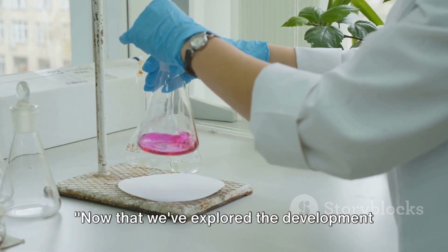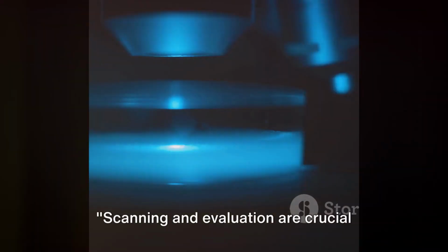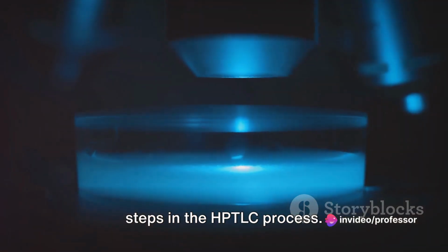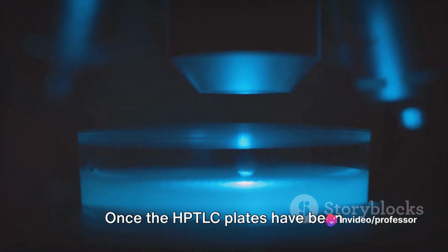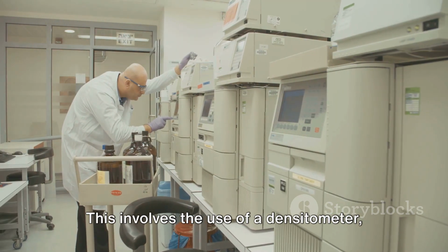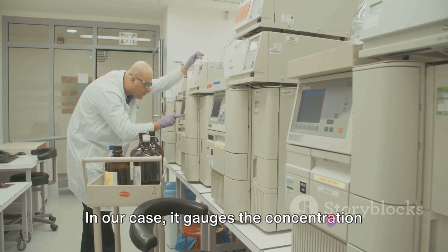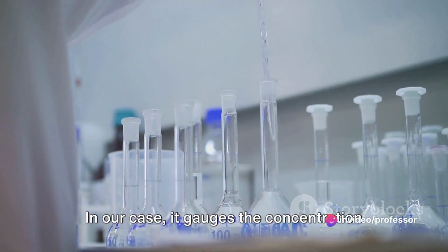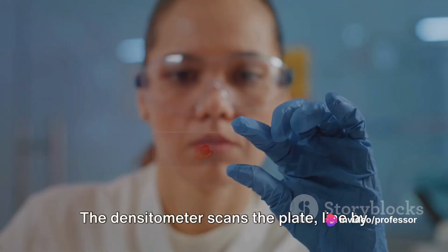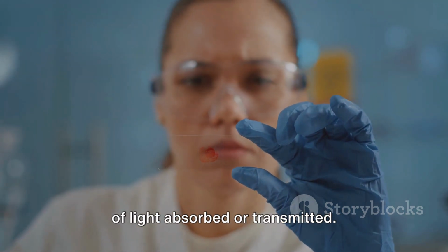Now that we've explored the development techniques, let's discuss how we scan and evaluate the results. Scanning and evaluation are crucial steps in the HPTLC process. Once the HPTLC plates have been developed, they're ready for scanning. This involves the use of a densitometer, a device that measures the intensity of light passing through a substance. In our case, it gauges the concentration of compounds on the HPTLC plate. The densitometer scans the plate line by line and captures data about the amount of light absorbed or transmitted.